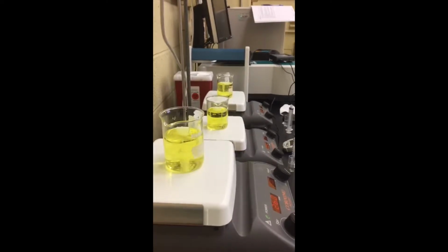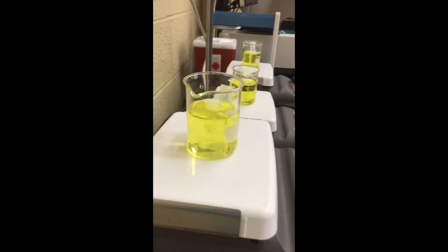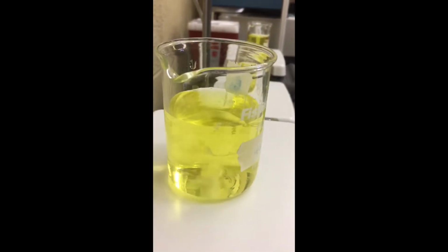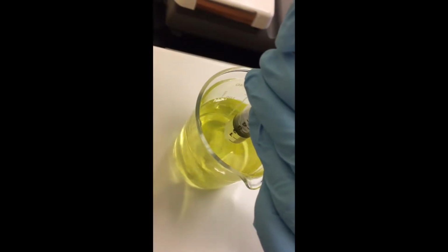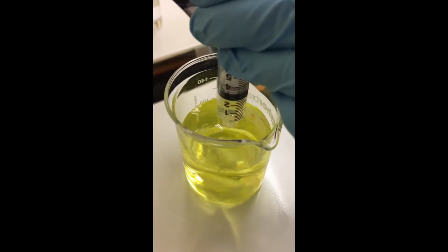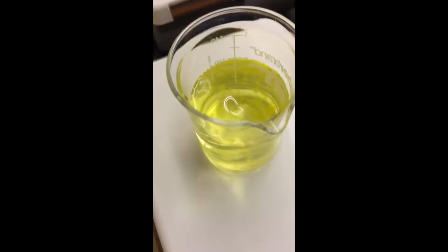For the first 10 minutes, samples were taken every 2 minutes. For the next 20 minutes, samples were taken every 5 minutes. And for the last 30 minutes, samples were taken every 10 minutes. To take a sample, a syringe was placed into the center of the mixture and 2 to 3 milliliters was removed. When doing this, no beads could be collected in the sample. If this occurred, the sample had to be put back into the solution and a new one had to be taken.